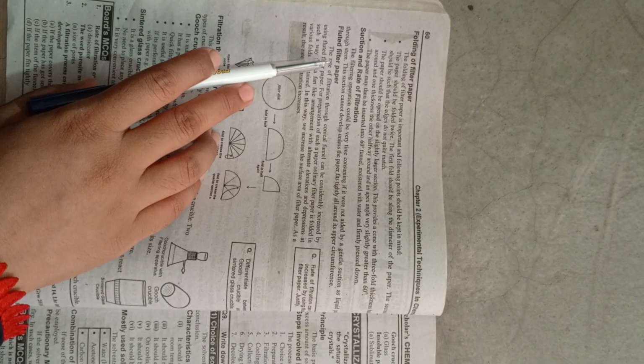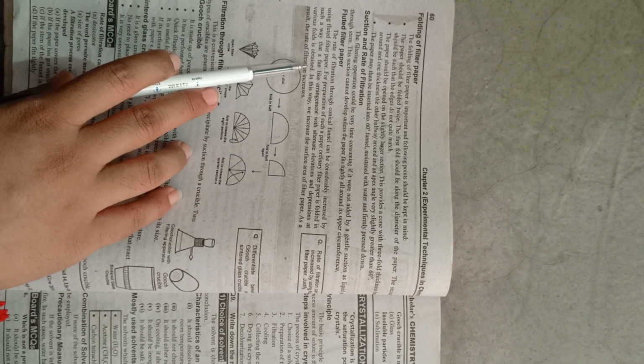आगे है fluted filter paper. The rate of filtration through a conical funnel can be considerably increased by using fluted filter paper. For preparation of such a paper, ordinary filter paper is folded in such a way that a fan-like arrangement with alternate elevations and depressions at various folds is obtained. In this way we increase the surface area of the filter paper. As a result the rate of filtration increases.